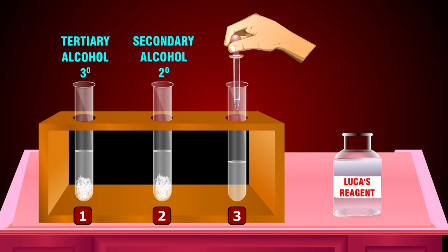In test tube number 3, there is no visual change which shows it is a primary alcohol.